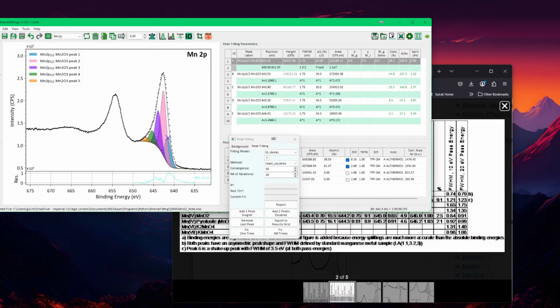We've seen that the resolution was quite poor, so maybe that whole thing will need to be at slightly more wider width. Okay, and also it's a Gaussian-Lorentzian library, so as you can see, if I just type A, the model is GL, just like on this paper, and that's why it's not fitting too well on the side there.